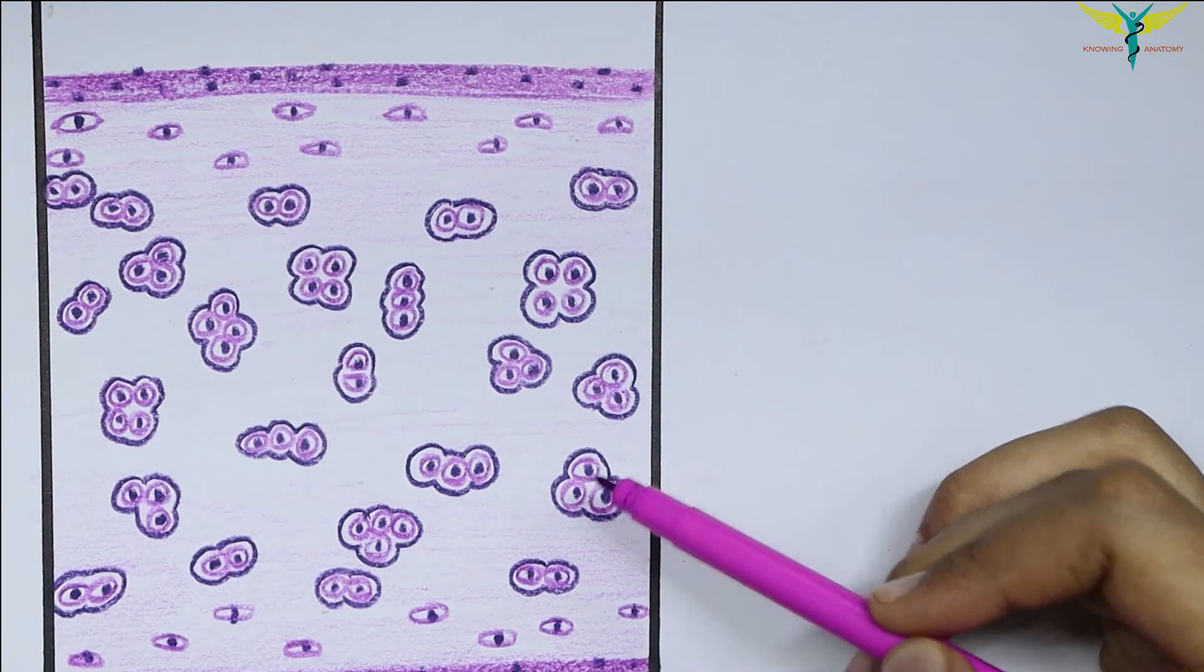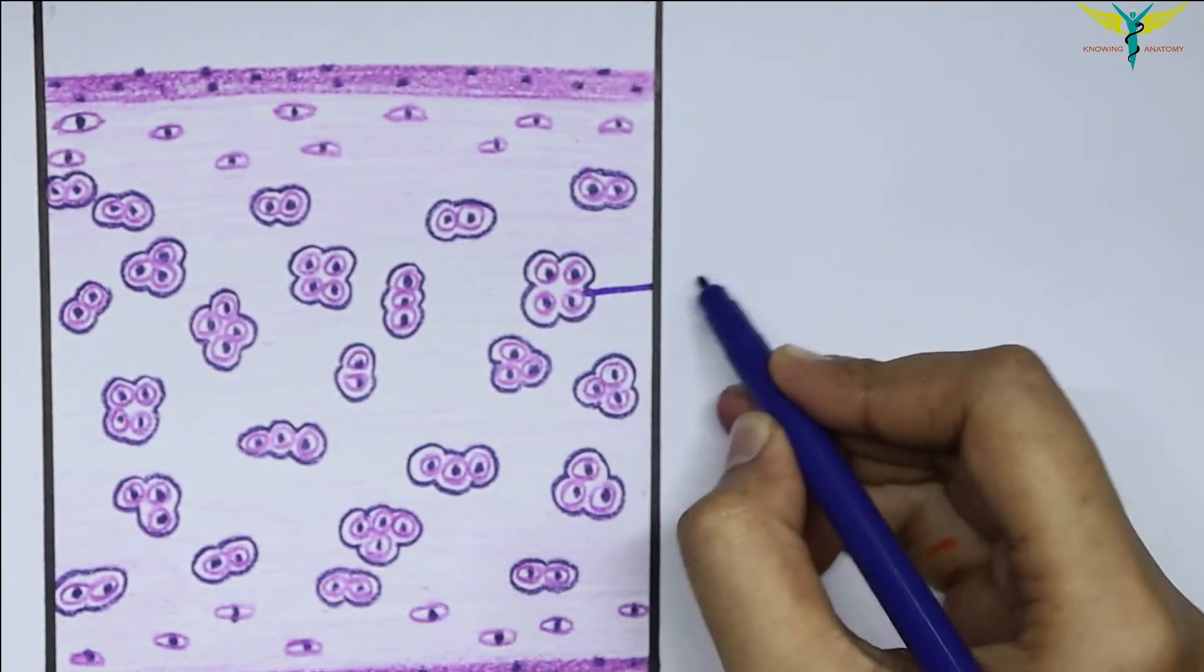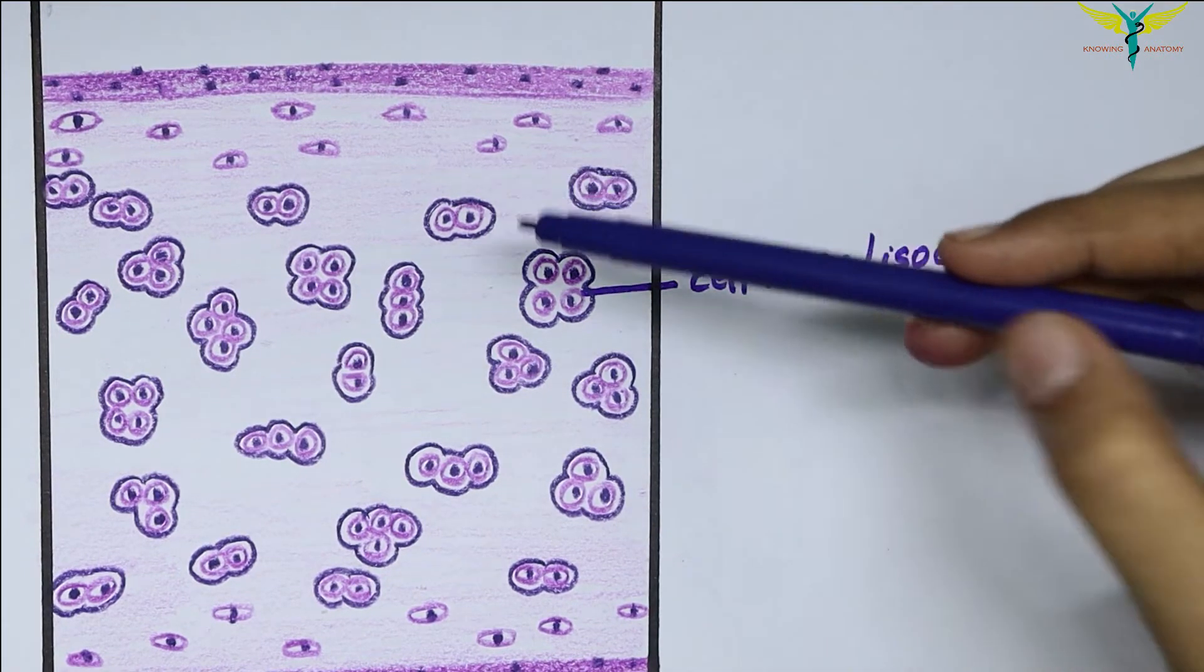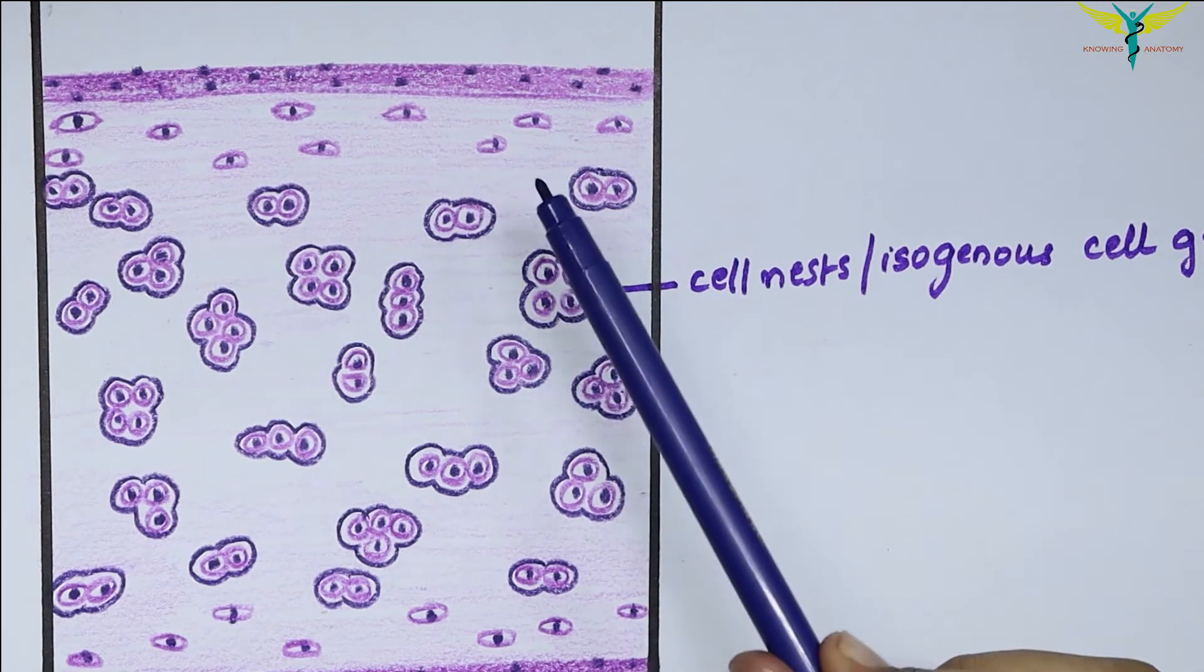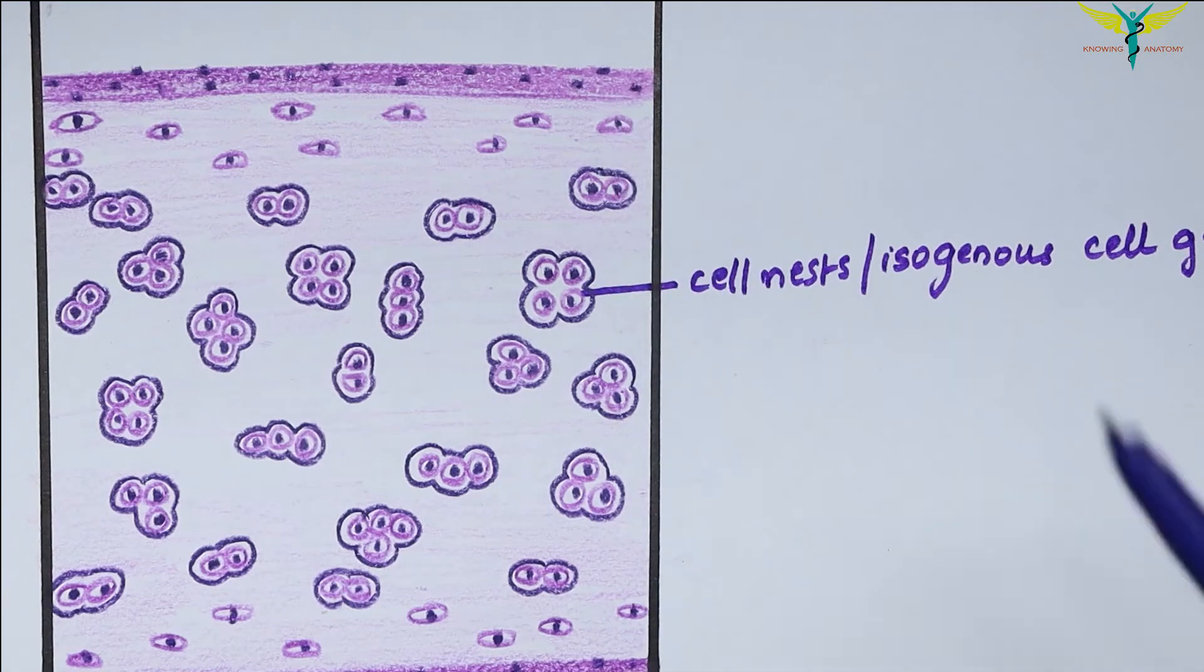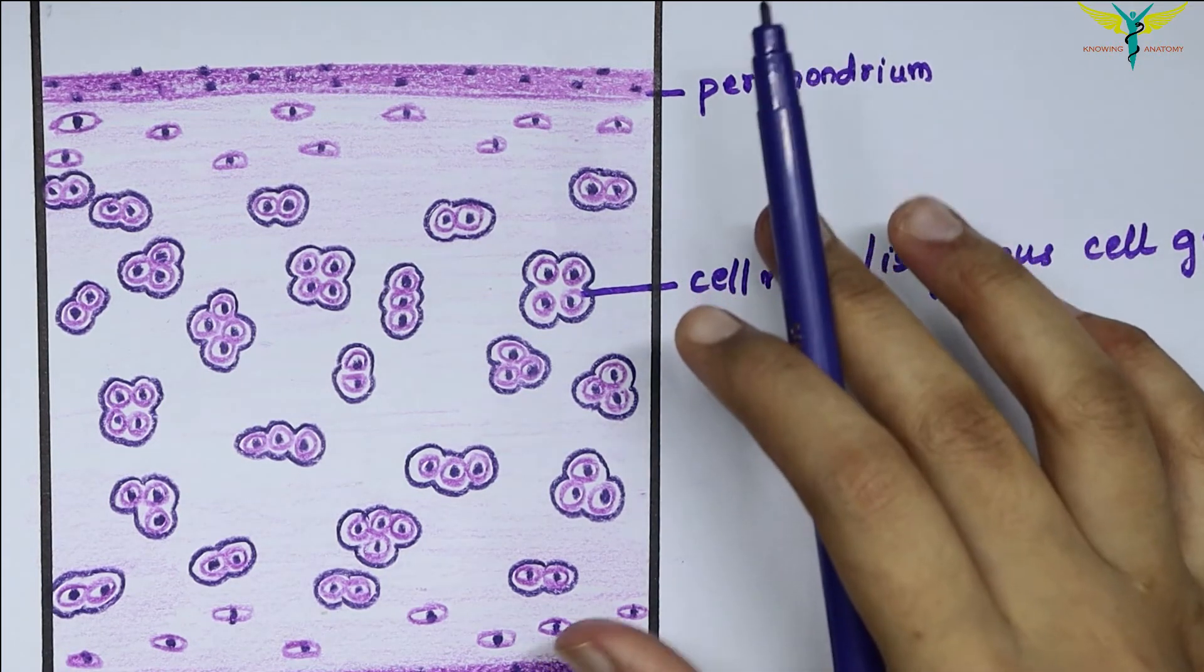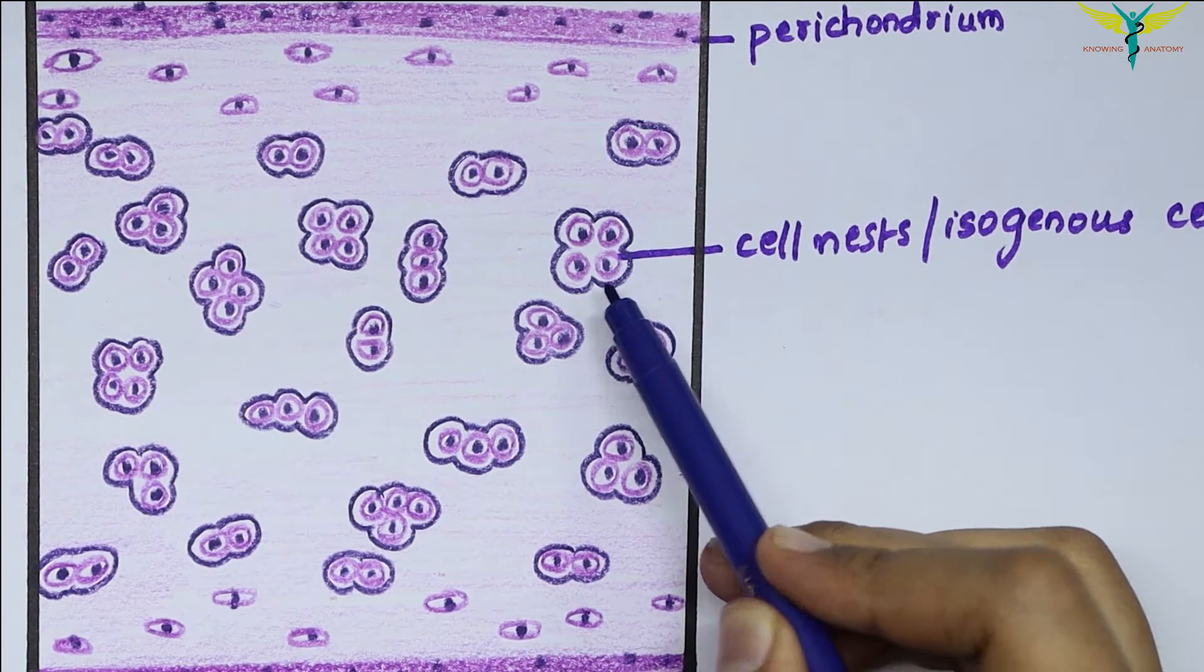A group of these cartilaginous cells are called as the cell nest or the isogenous cell groups. Towards the periphery of the cartilage, the cells are small and elongated and they lie in the direction that is parallel to the surface, that is the perichondrium. This is the perichondrium, and these elongated cells become indifferentiatable from the fibroblasts. These are the chondrocytes and they form the cell nest.